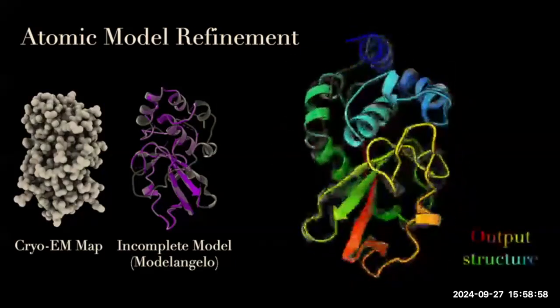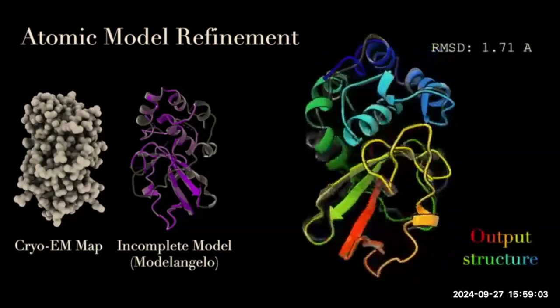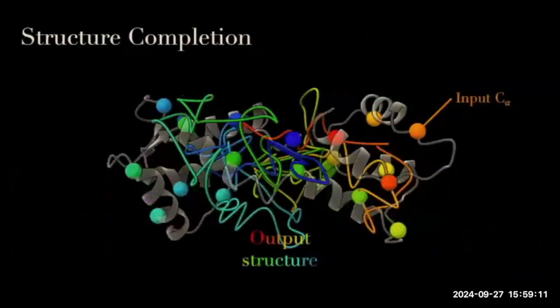So now I'm going to show the diffusion trajectory that our method gives. In gray, this is the ground truth structure that we've been using to generate the density map. Again, this is a simulated density map. And then in rainbow colors, you see the optimized trajectory.